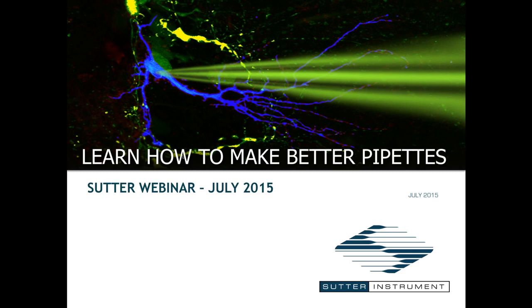Trough filaments tend to pull the glass out longer, and it's a little bit more gradual. So if you want a really, really long, sharp electrode, you can use a trough filament, but usually it's too flimsy and too weak to actually penetrate the cells or the tissue. So I tend to prefer a box filament for pretty much all applications.